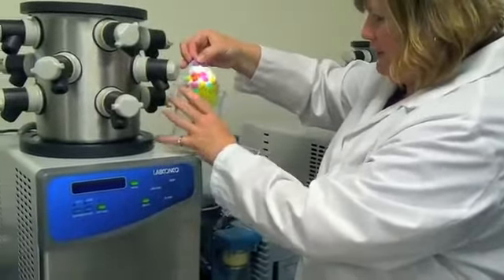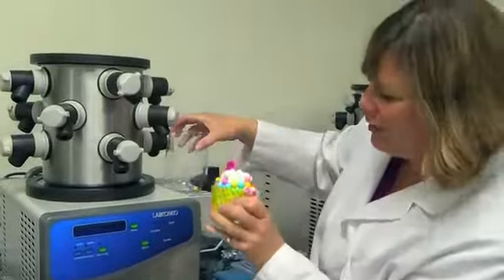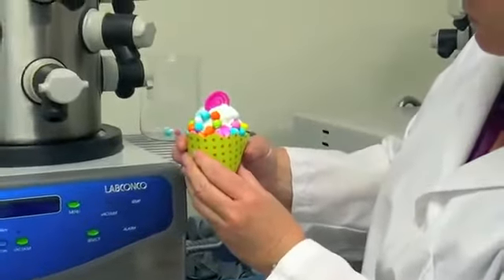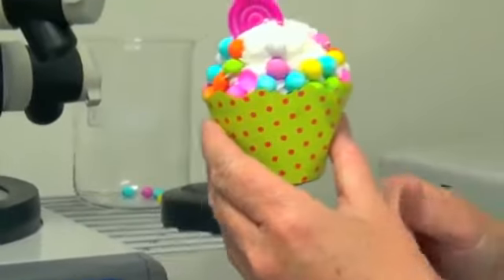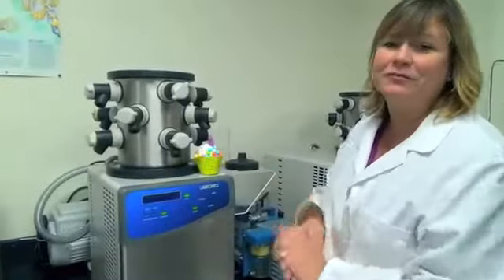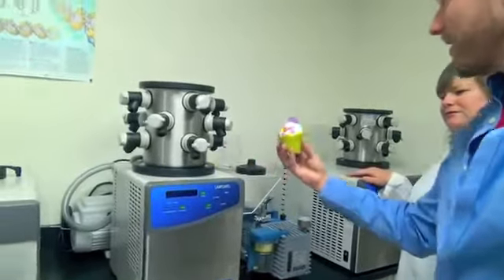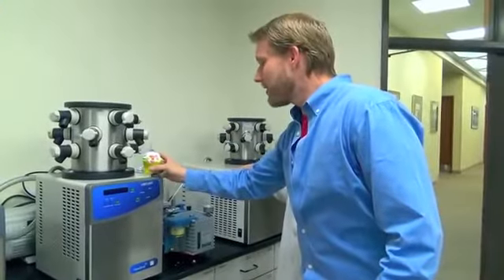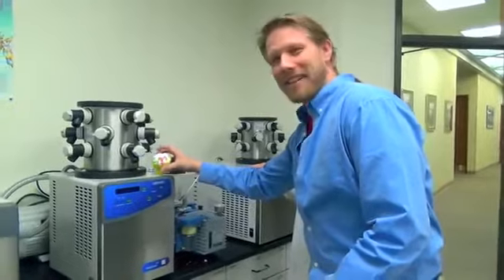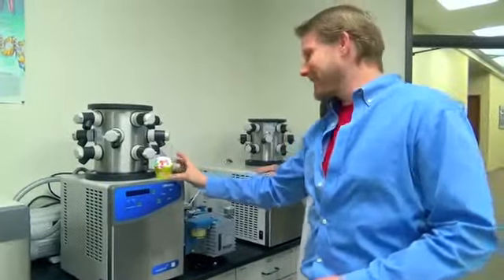We lost a few gumballs, but overall it looks awesome. We've learned that icing does not work like glue once it's been freeze-dried. It's lighter, that's for sure. Oh my gosh — you can hear that, it's hard now, and it drops all of its little candy pieces.